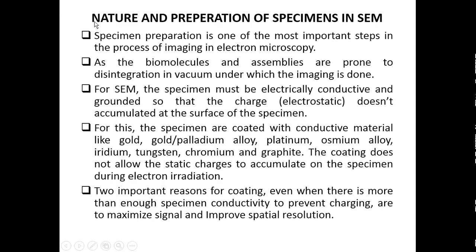Now we have to know the nature and preparation of specimen in SEM. I told you the preparation of specimen is not simple in the case of electron microscope. In the case of optical microscope, it's quite simple.